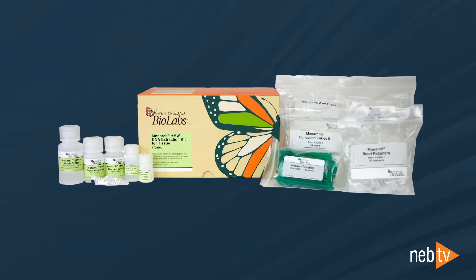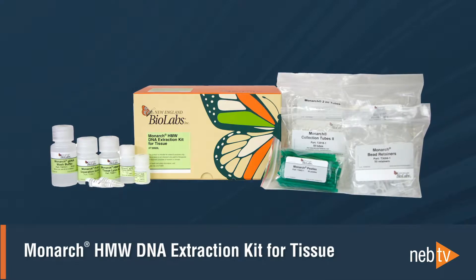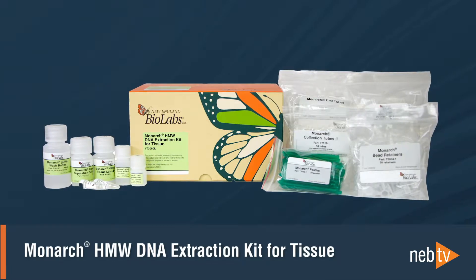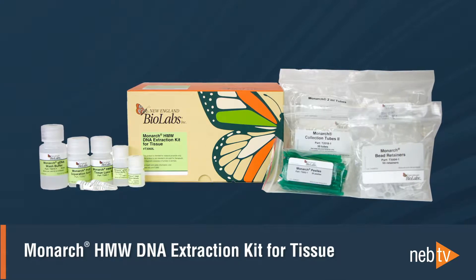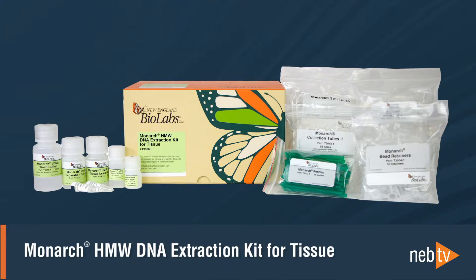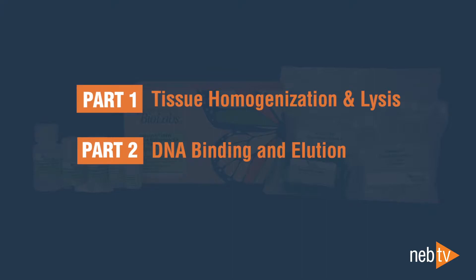In this video, we're going to walk you through the protocol for high molecular weight DNA extraction from animal tissues using the Monarch High Molecular Weight DNA Extraction Kit. This kit enables isolation of very large DNA fragments, even megabases in size, when working with soft organ tissues. The protocol is broken into two parts: tissue homogenization and lysis, and DNA binding and elution.